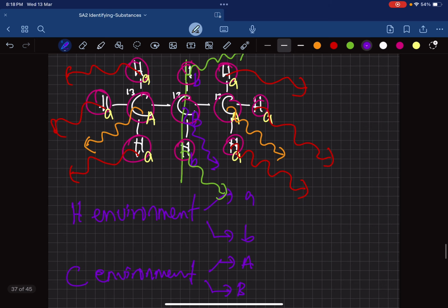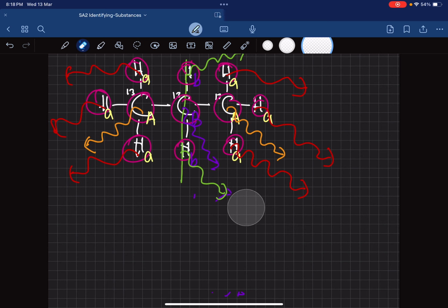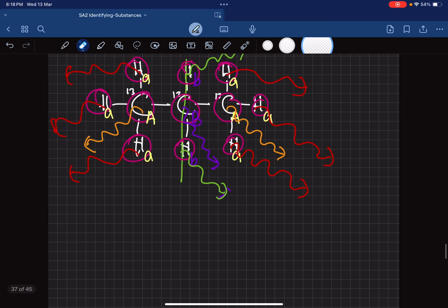So what will happen is, if we look at hydrogen signals in this example that I'm doing here with you, you will see a line like this. It will start at 0, it will end at about 15. This is called ppm. You don't have to worry about it.